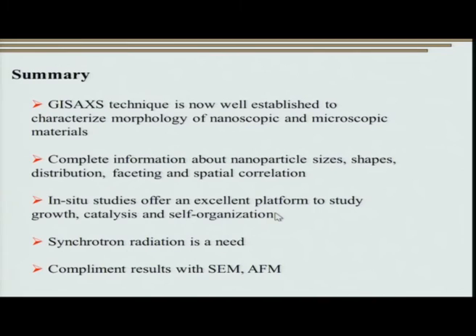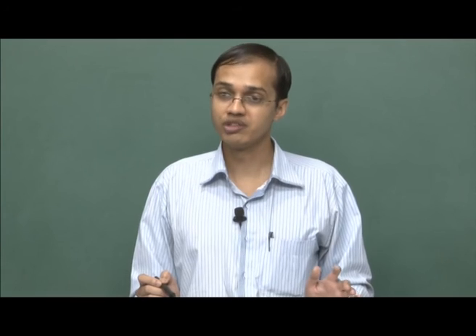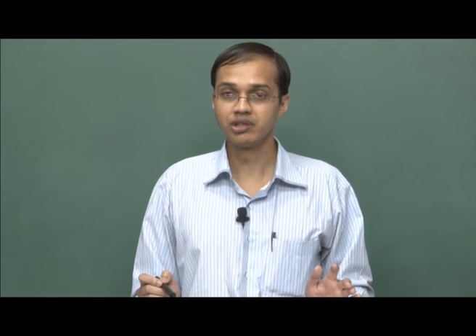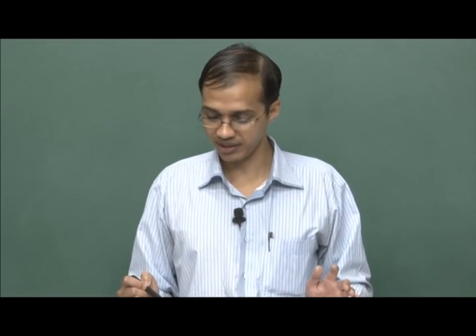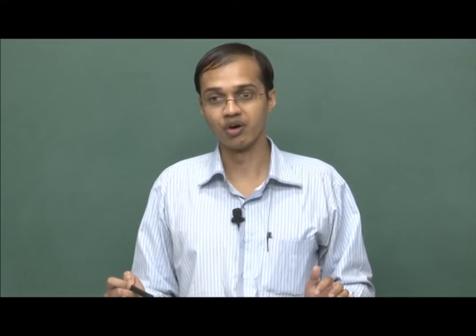They offer an excellent platform to study growth, catalysis and self-organization. Having said that, synchrotron radiation is almost necessary. I will make a very strong statement and say that synchrotron radiation is necessary for doing good quality grazing incidence small angle X-ray scattering, and having done it, it is always a good idea to confirm your results with other techniques like scanning electron microscopy, scanning tunneling microscopy or AFM.